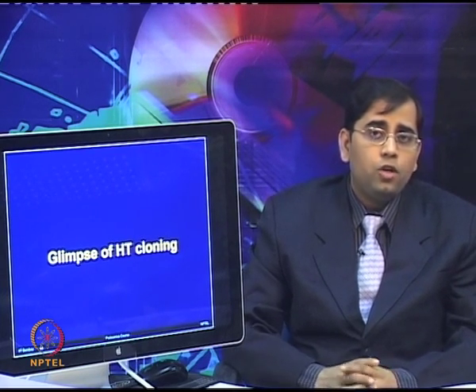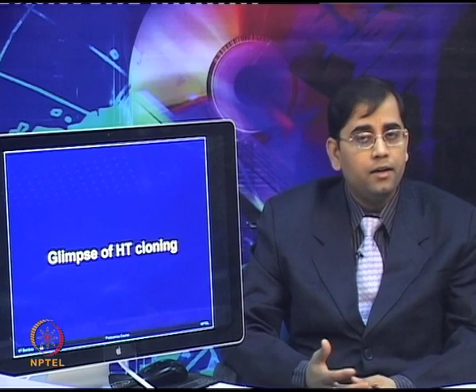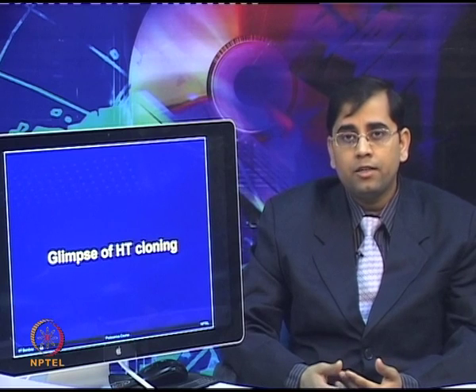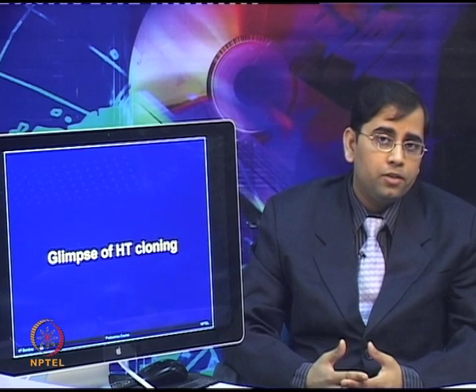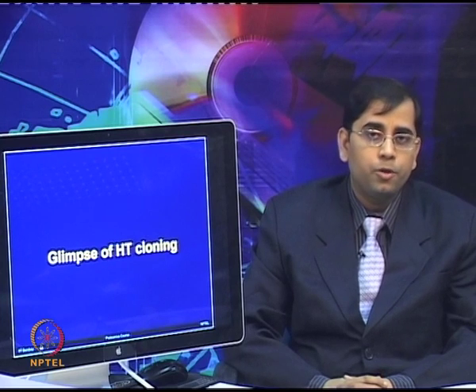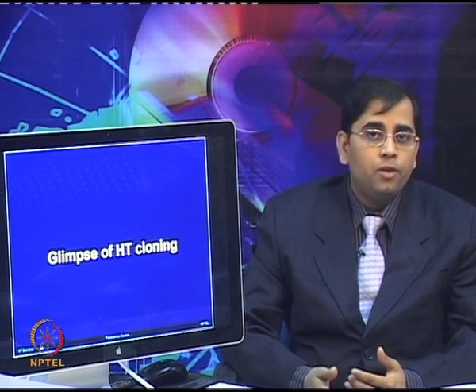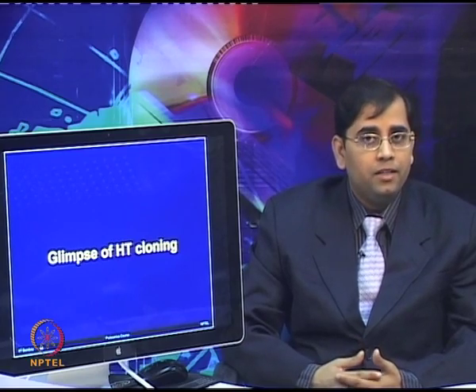That is why a lot of these steps have been automated, and laboratories which are using these high throughput systems, high throughput platforms, have modified the systems according to the requirements, and the system has been automated based on robotic platforms. I will show you a few images which were obtained during my postdoc in Dr. Josh Labaer's lab at Harvard Institute of Proteomics. So, these images will provide you a glimpse of various steps involved in high throughput cloning and how one can perform these experiments in a high throughput manner.